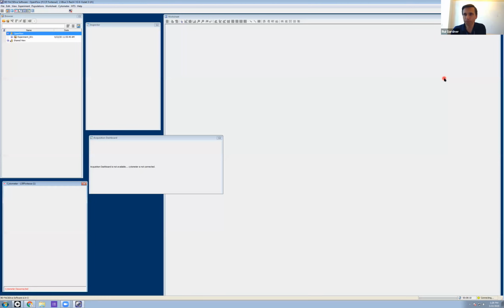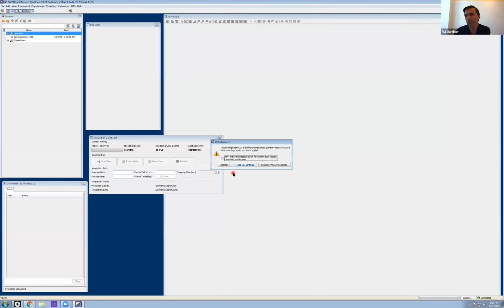Kathy, yes. I have a few questions here from the audience. So the one question here is asking about the QR values, and this is a question for I'm having a little bit of a hard time hearing there, Rui. Yeah. Can you hear me well now? Yes.